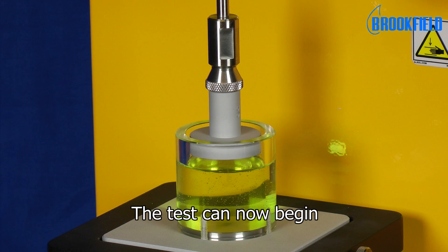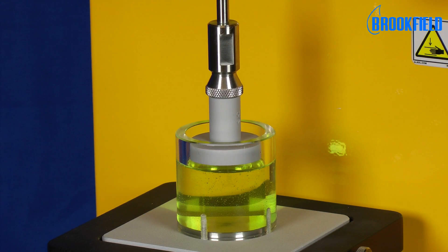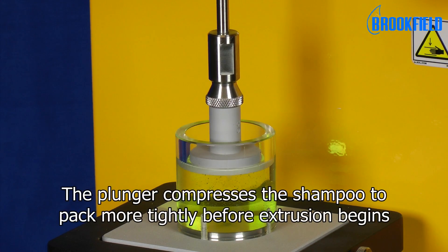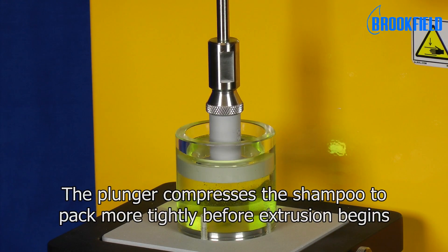The test can now begin. At the sample surface, the plunger compresses the shampoo to pack more tightly before extrusion begins.